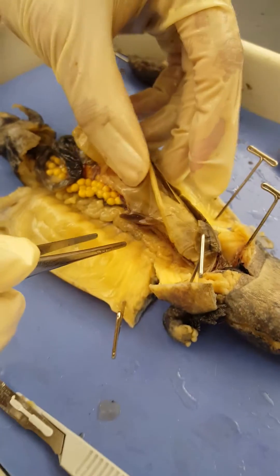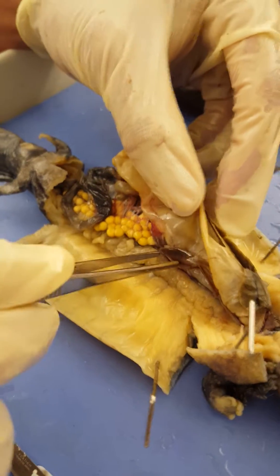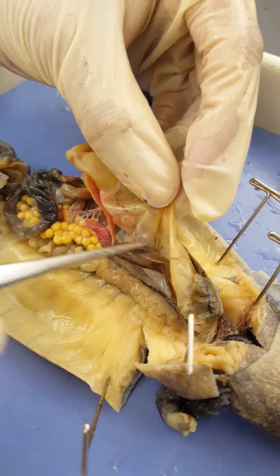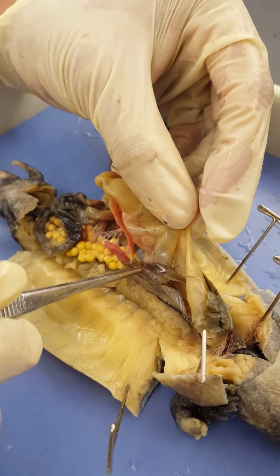Here is the oviduct. Here is the ovaries. This structure right here is the spleen. This structure that is red at the bottom is the lungs, which is never used by salamanders.